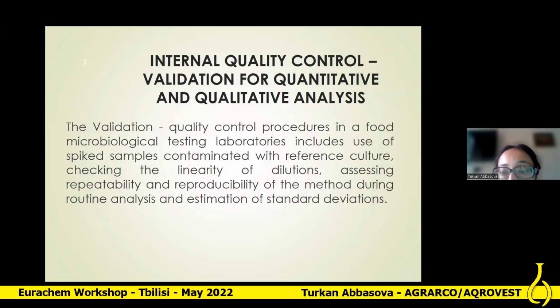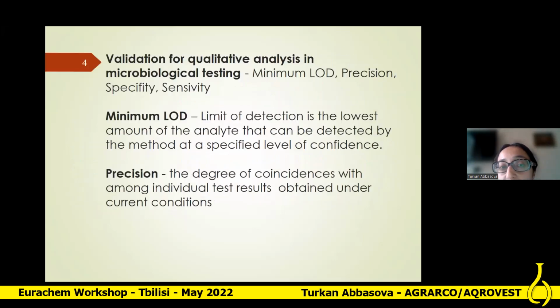As microbiologists know, a laboratory has quantitative and qualitative analysis, and for qualitative analysis the laboratory should also provide validation. Using these terminologies, the laboratory should determine the minimum limit of detection, precision, specificity of the method, and sensitivity of the method for the qualitative analysis.